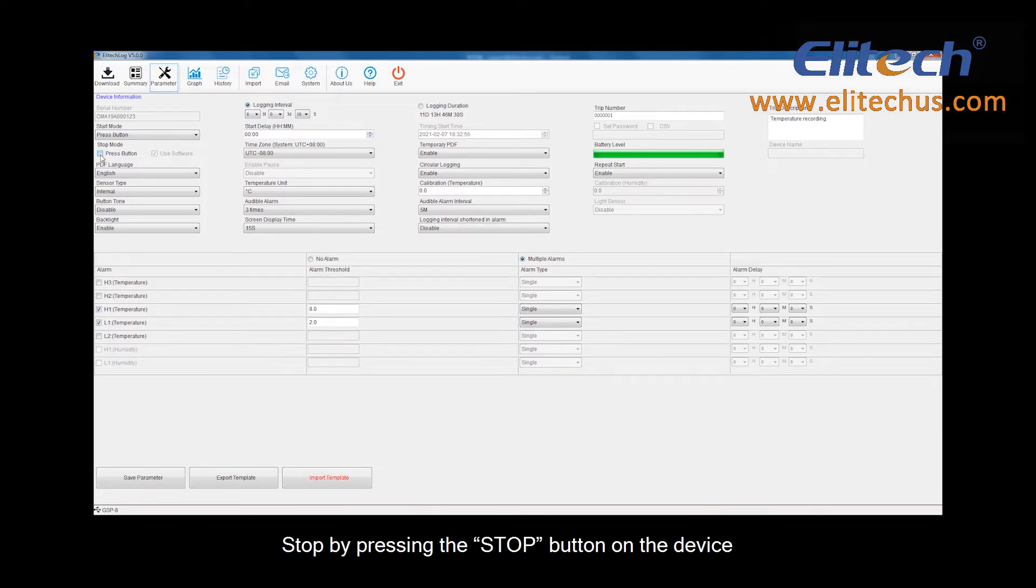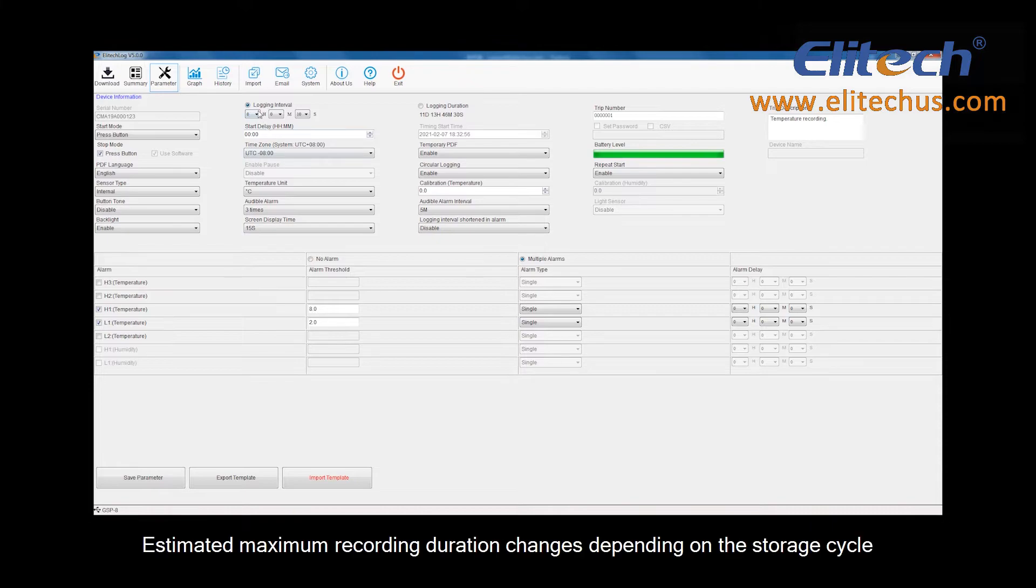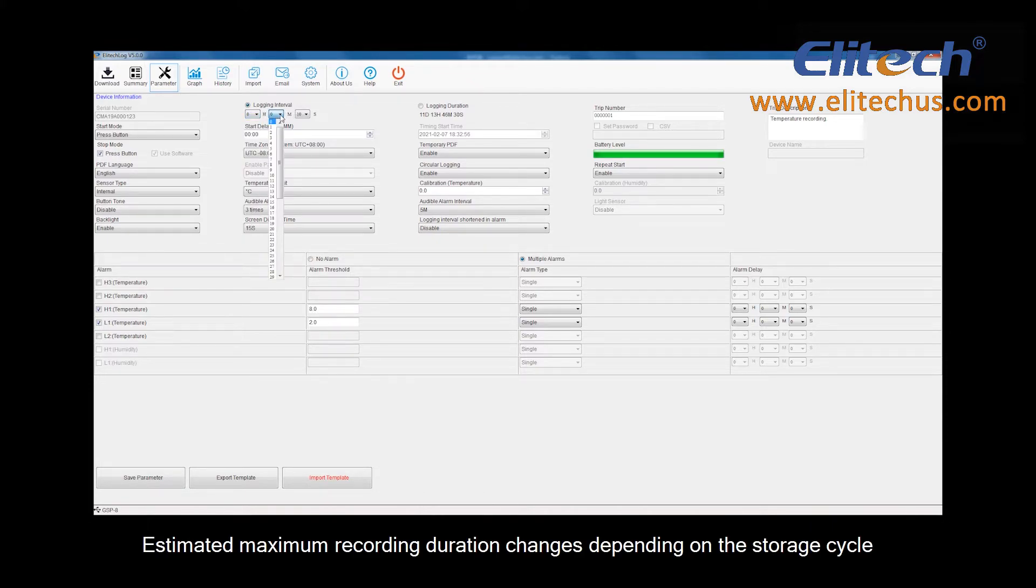Stop by pressing the Stop button on the device. Determine at what interval the measurements will be recorded. Estimated maximum recording duration changes depending on the storage cycle.